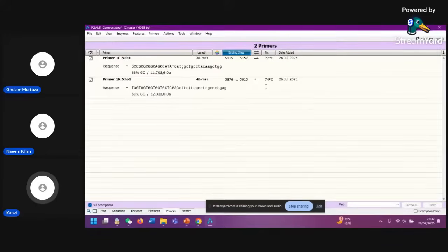There's one another question, which is why it is important for forward and reverse primers to have similar TM values. You can't calculate one by one. It depends on both calculations. Have you used the Amplifix software? I guess the candidate would not have used it. I would recommend the suggestion given by sir, and you can always revert back to sir. We can make sure that if you're getting any problem regarding the same.